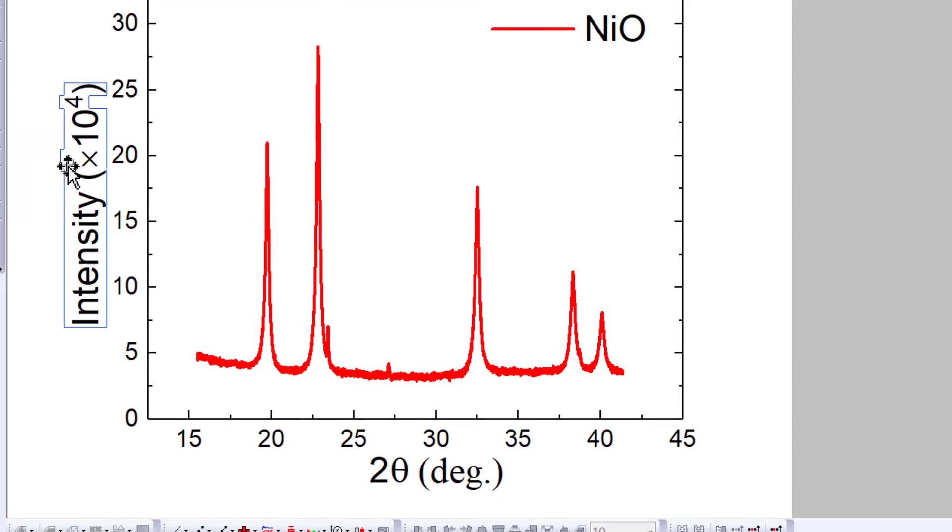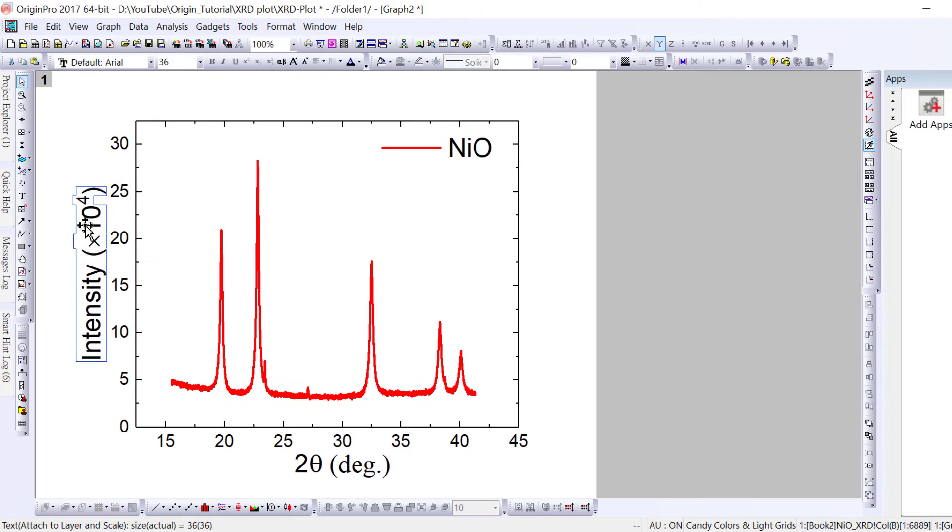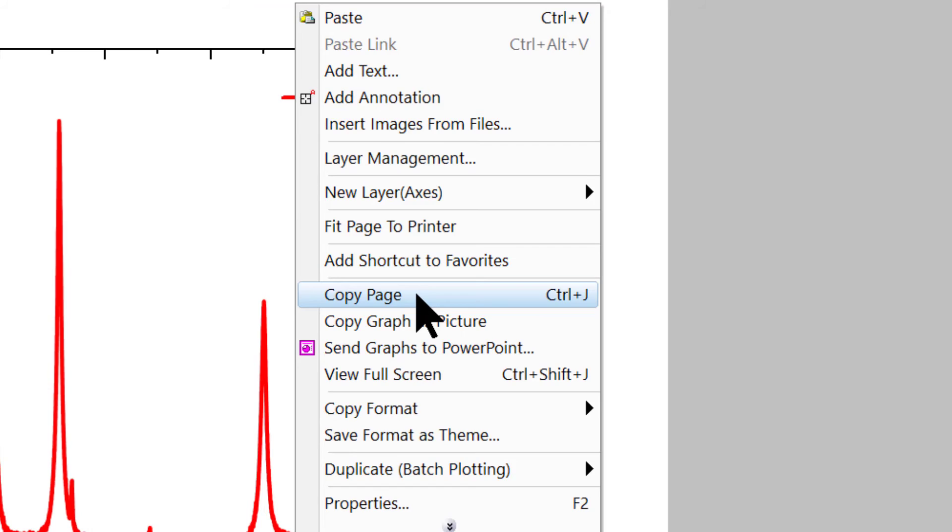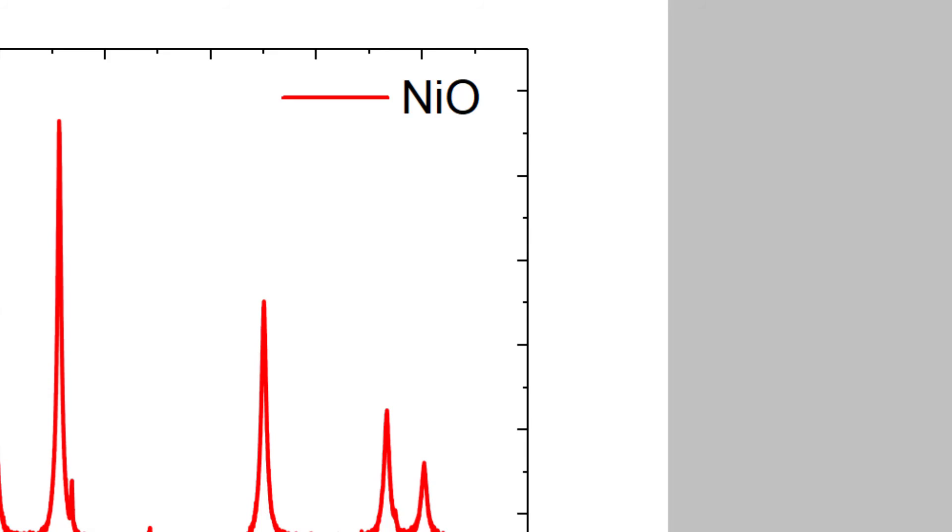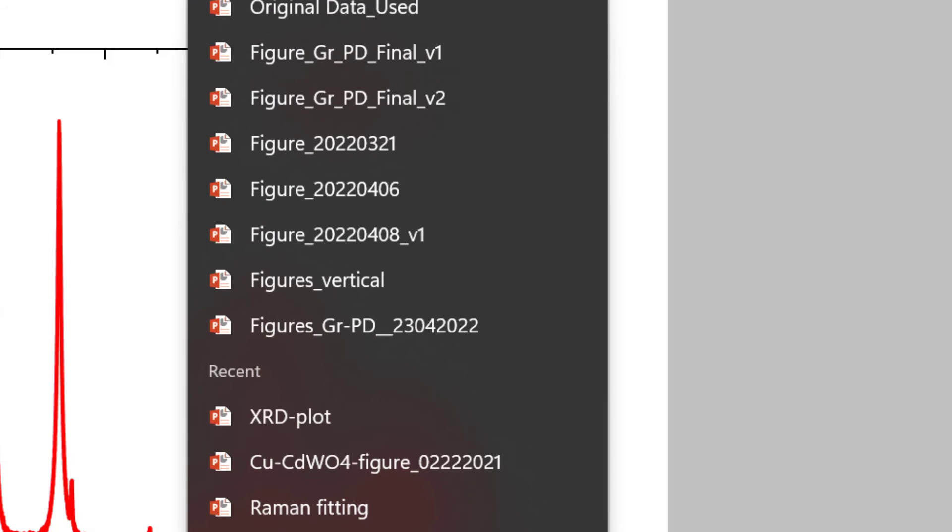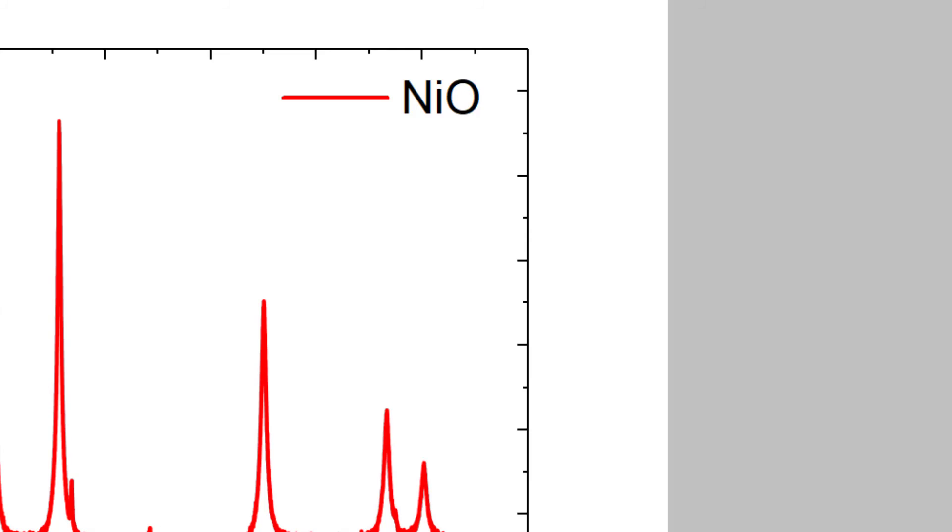This way your intensity becomes ×10^4. Right-click and copy page. Once you copy, open your PowerPoint or Word file and paste.